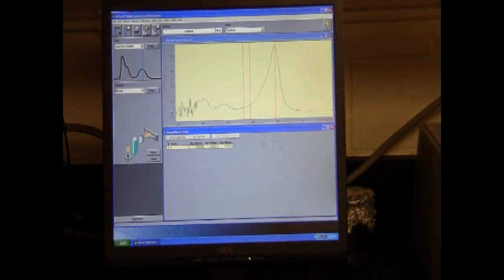And here you can see that I have an absorbance of 0.45. What absorbance do you want? You want an absorbance of 0.5. And this is really close enough. So you would know that, what was your total dilution? It was 4, 16, 64, 256. So if you make approximately a 250-fold dilution, you should get an absorbance very close to 0.5. You can calculate that exactly.